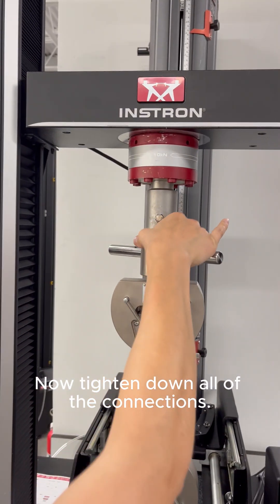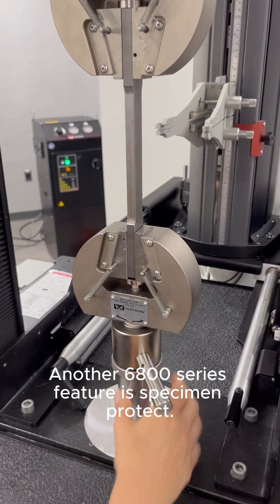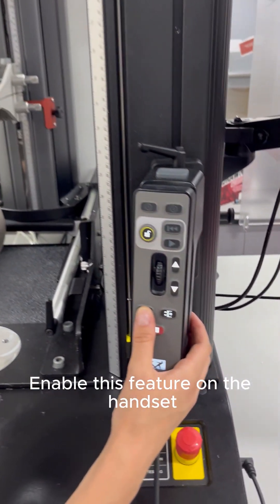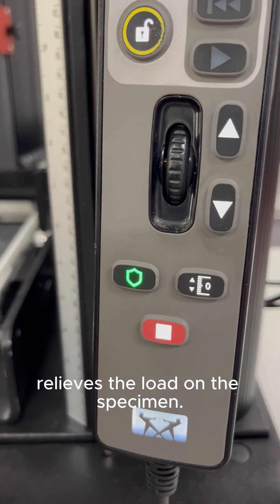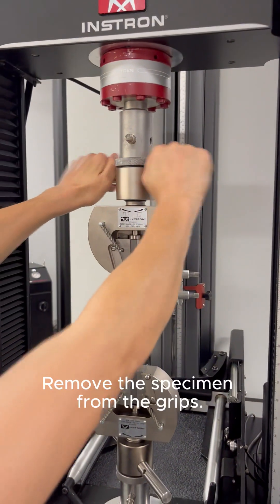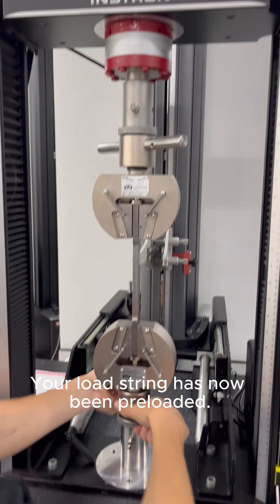Now tighten down all of the connections. Another 6800 series feature is specimen protect. Enable this feature on the handset so the crosshead automatically relieves the load on the specimen. Remove the specimen from the grips. Your load string has now been preloaded.